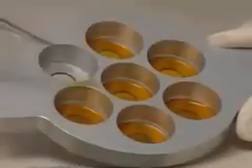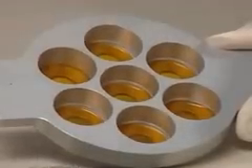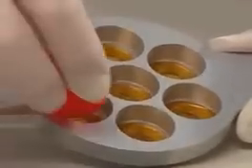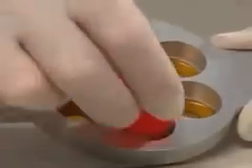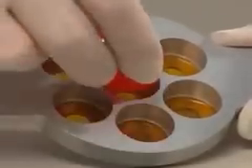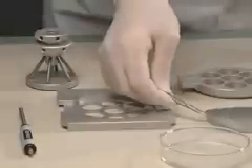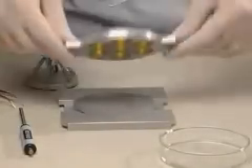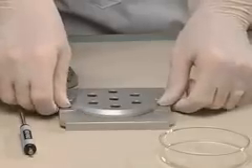Place the prepared macro carriers with the DNA gold side facing up into the macro carrier holder. Ensure that they are in place using the seating tool. Place a stopping screen in the stopping screen holder, then fit the macro carrier holder onto the stopping screen holder.